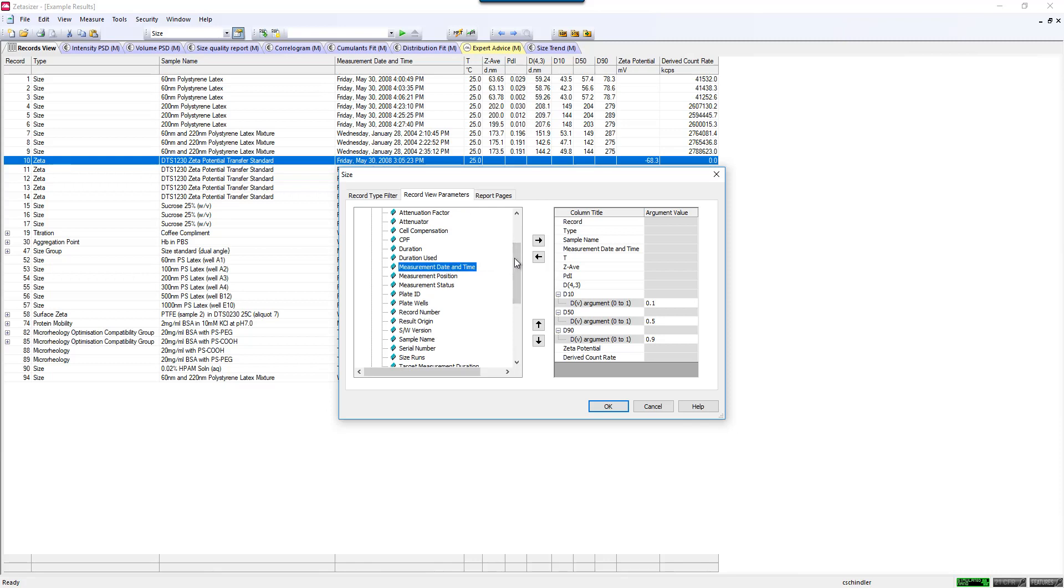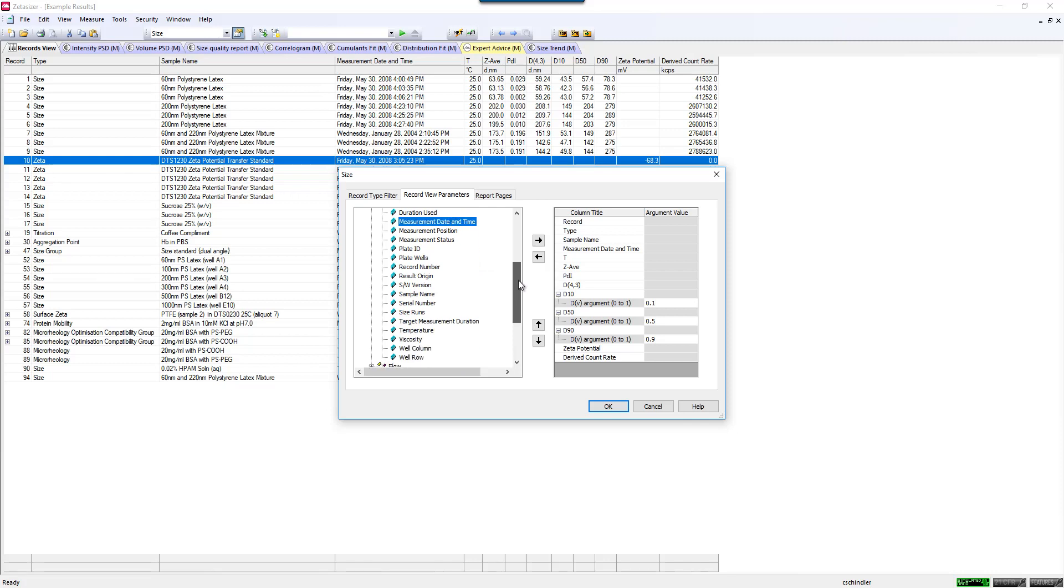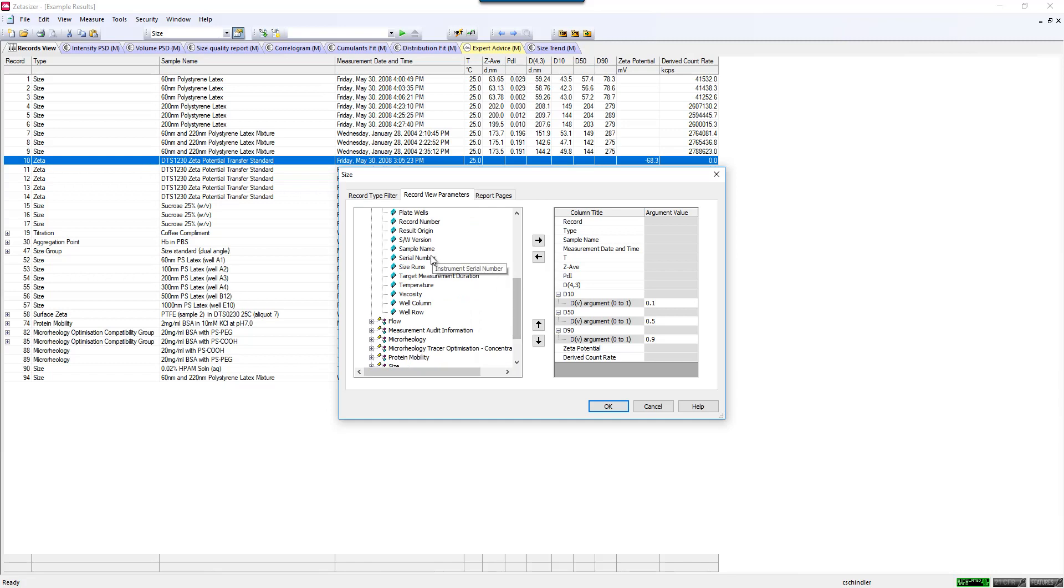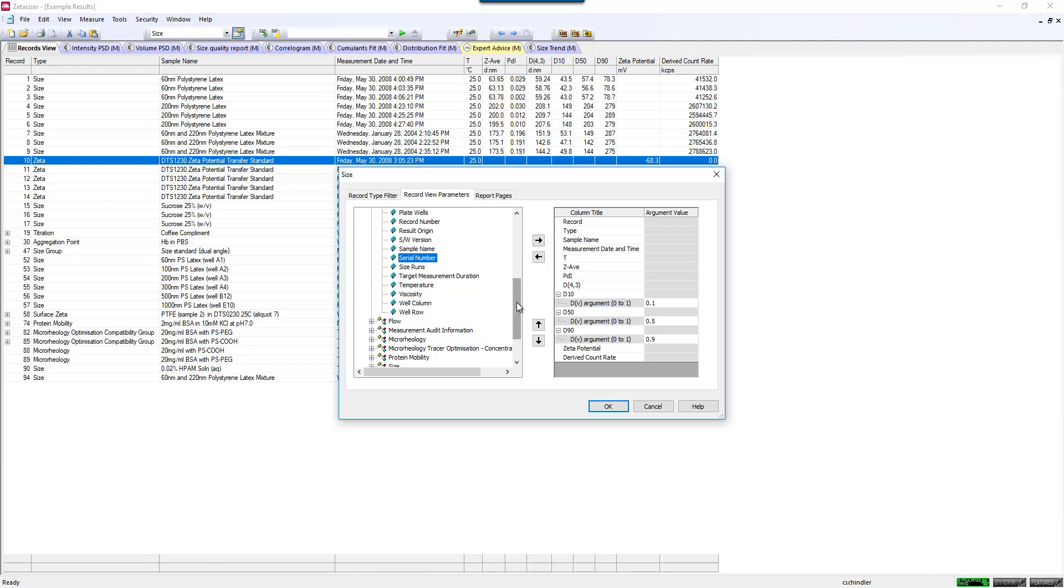Measurement date and time is a good one to display. You may want to display your serial number of your instrument in case you ever have any issues or questions about the data and the instrument and you write into our help desk. They're always going to ask you for your serial number, so that's an easy way to always just have it on your record view if you like.